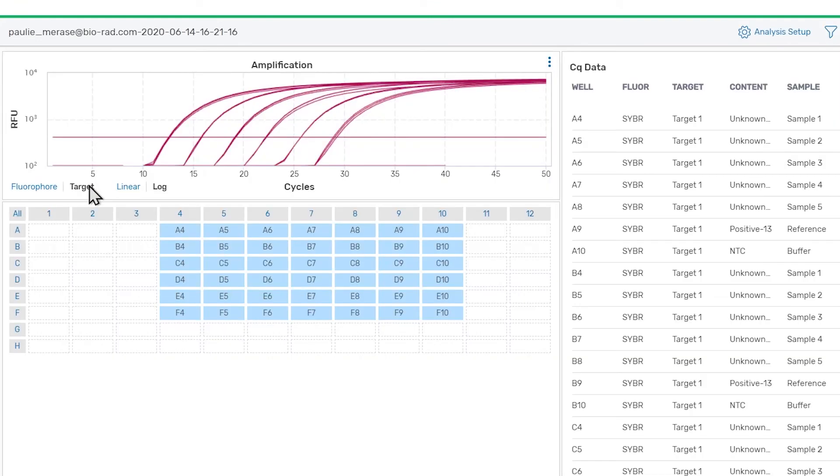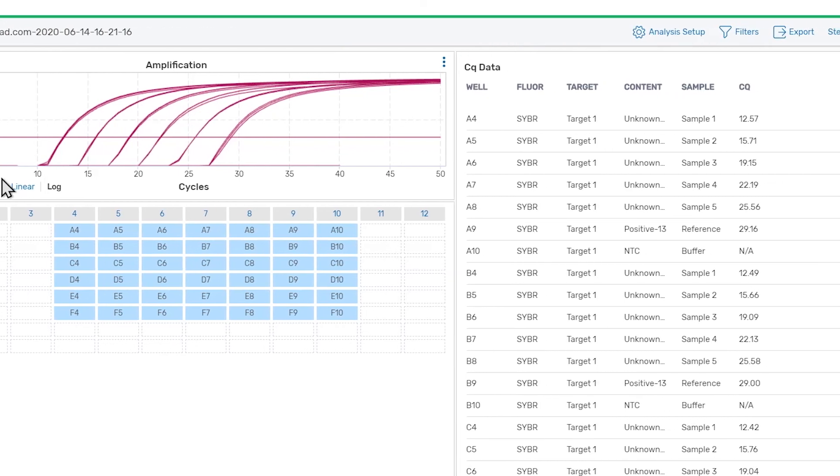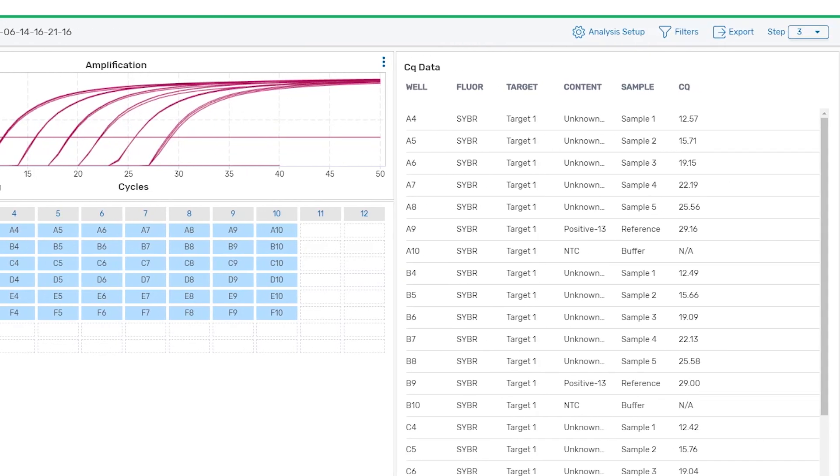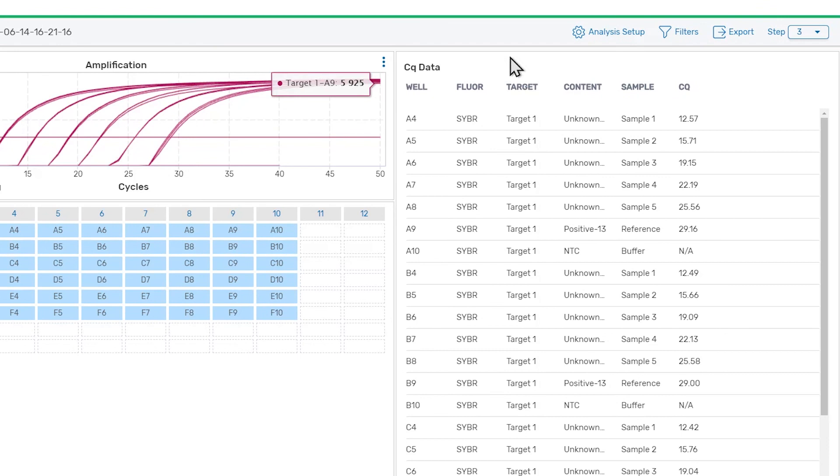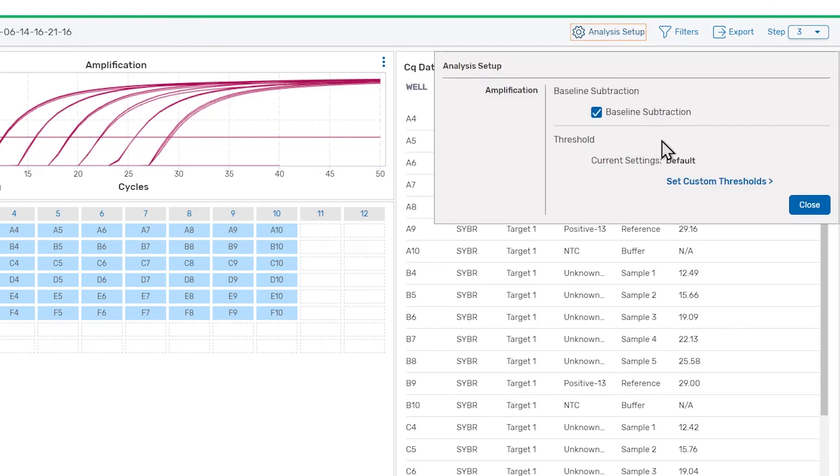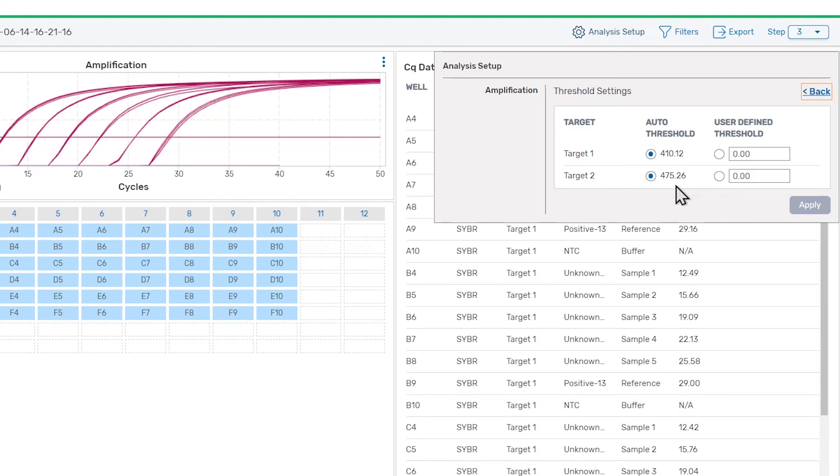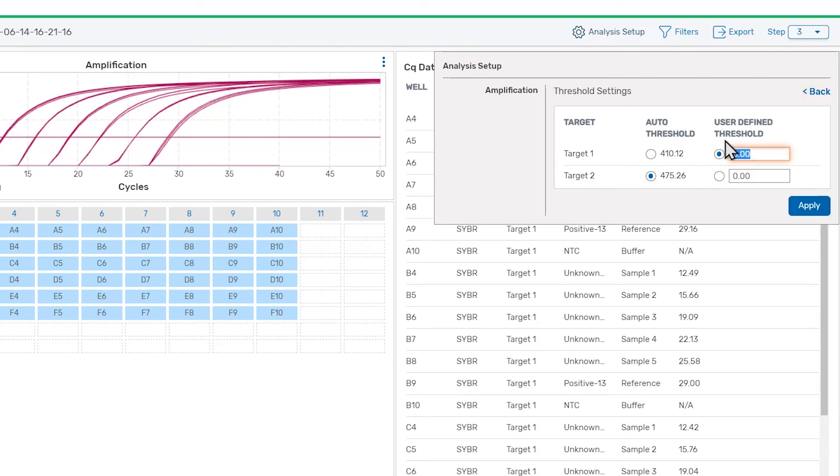If you need to set thresholds to specific values, you can do that in the analysis setup panel. Clicking set custom thresholds will open the threshold settings. Here you can see the auto-calculated thresholds. To set a threshold to a specific value, enter the value into the input field under user-defined threshold on the right.